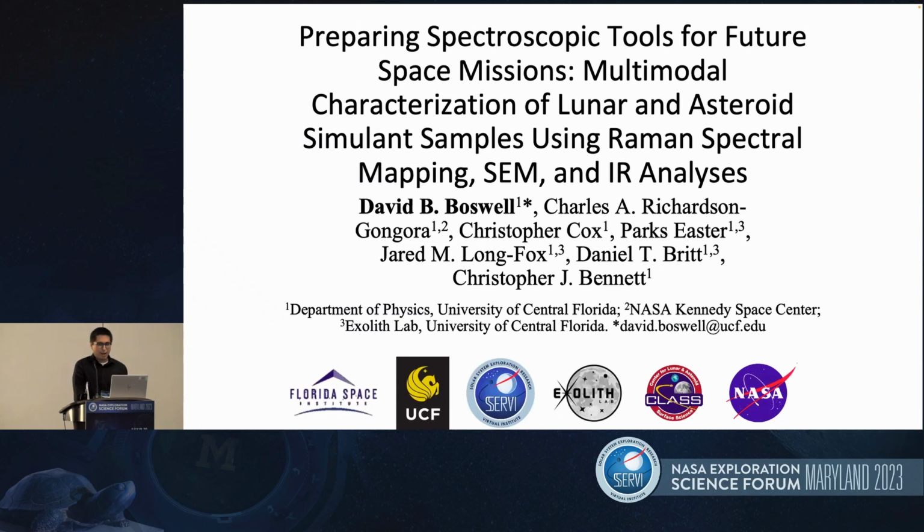Hello, everyone. I'll be presenting an abstract on preparing spectroscopic tools for future space missions, utilizing Raman spectral mapping and eventually scanning electron microscopy and infrared multimodal analyses to characterize lunar and asteroid simulants.